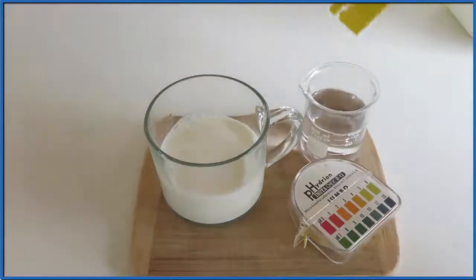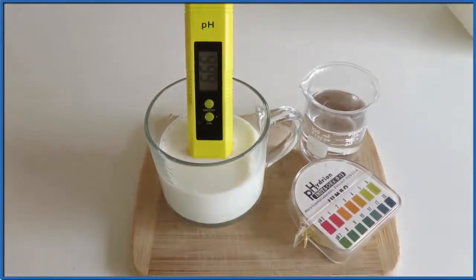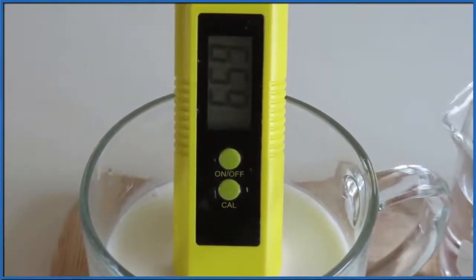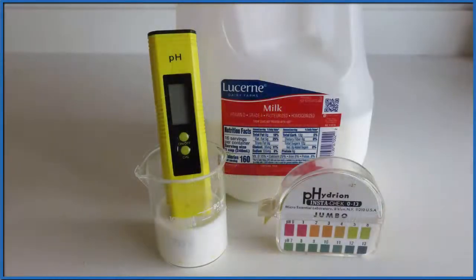We can confirm the pH of milk with a more accurate reading using a pH meter. I've calibrated my pH meter, and when I put it in the milk, it's going to read the pH out to two decimal places. We let it equilibrate, and it goes to 6.59 — just like our pH paper told us, milk has a pH between 6 and 7. So milk is acidic because its pH is below 7, but it's only slightly acidic.